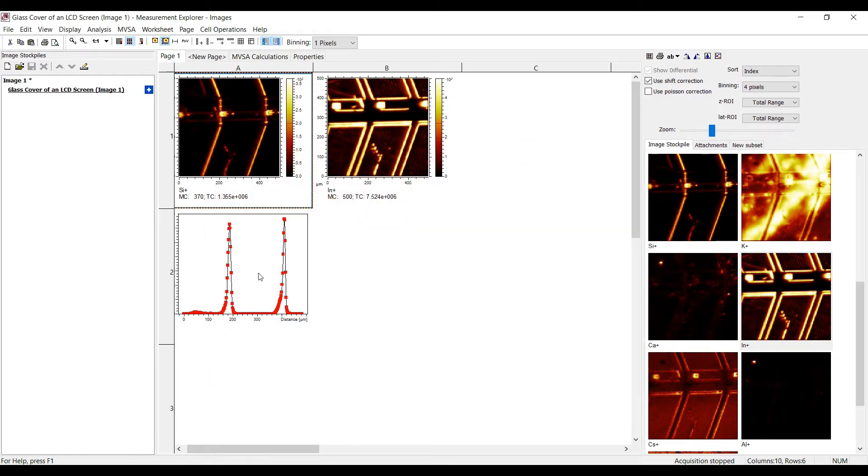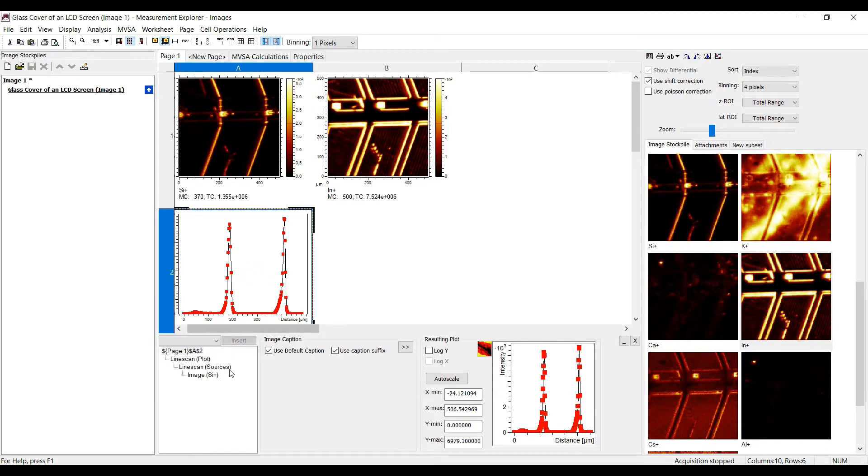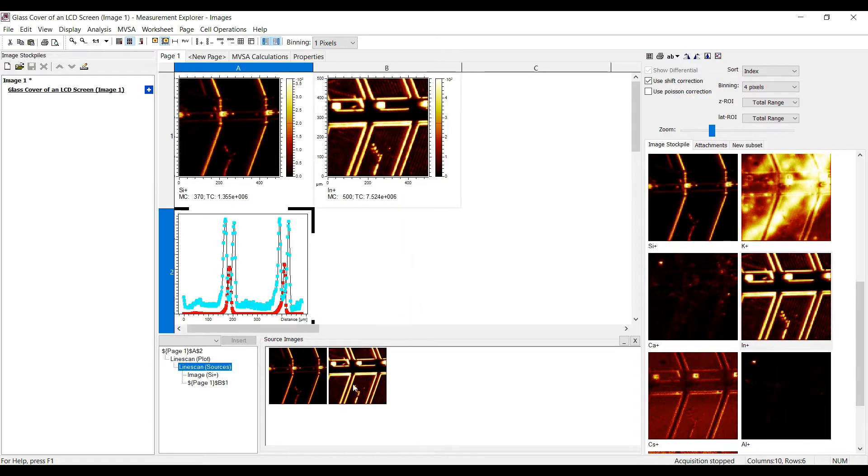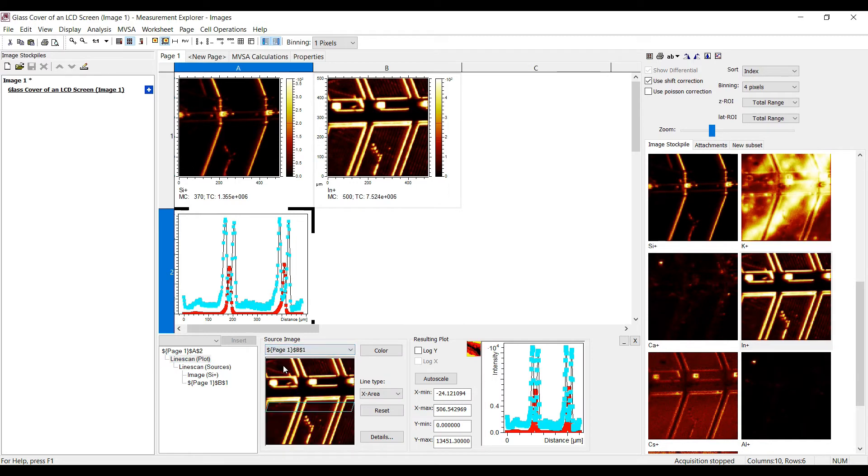But how to add more than one source image to the same line scan? Open the cell properties and select the entry line scan sources in the property tree. Add more source images with drag and drop. The line scan will now show the plot for all added source images with the same definition of position.